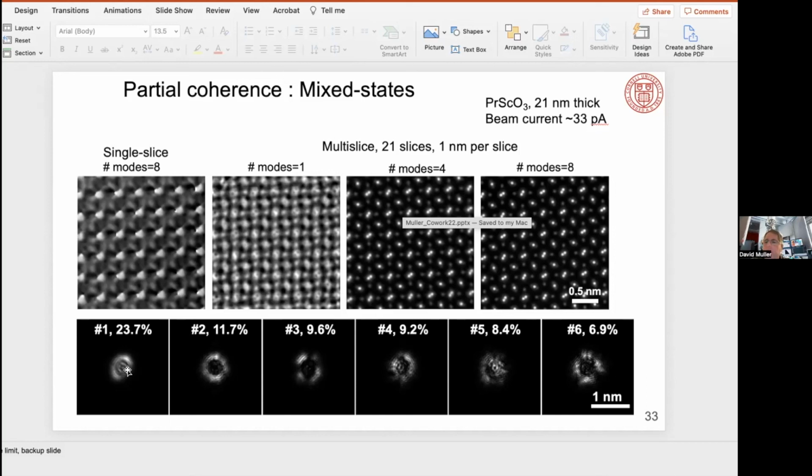What's interesting with these materials is if you think about it, the Debye temperatures are actually above room temperature. So the change in thermal vibration is not as big as you might imagine. Maybe we'll get a factor of 2 if we cool down to liquid nitrogen, but the zero-point modes are actually a very significant part of what we're already seeing. So if I went from nitrogen to helium, you wouldn't see much at all different, but there'd be a little bit of an improvement at nitrogen temperature.